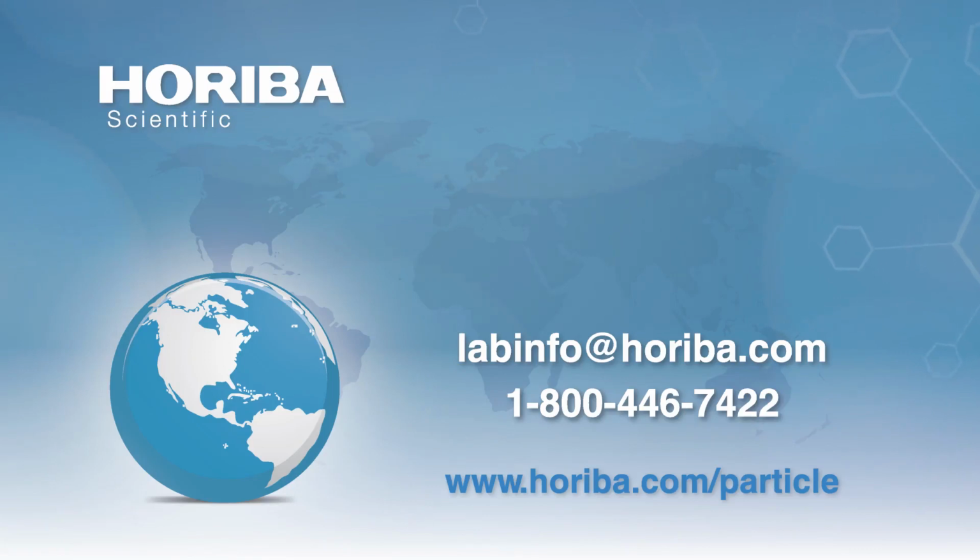So that's one extreme, and part of their problem is they were just too distracted by other things. So you'll need an operator that's going to get the right material into the analyzer and follow the procedure carefully, and that's it. The verification usually is not rocket surgery, but you need to be careful. That's all.